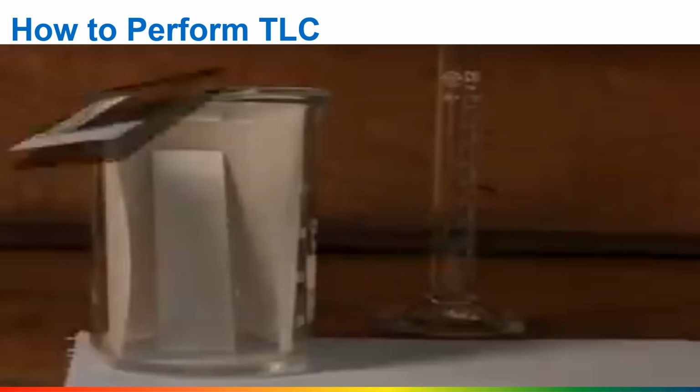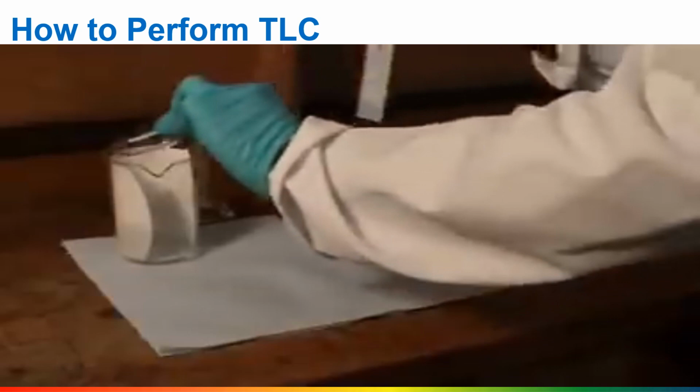Once the solvent front has got to the top of the plate, remove the lid, take the plate out and draw a line where the solvent front is so you can work out your RF values.